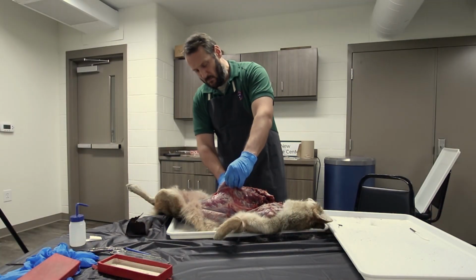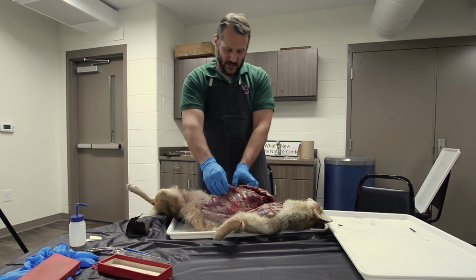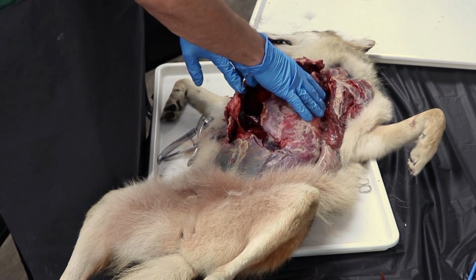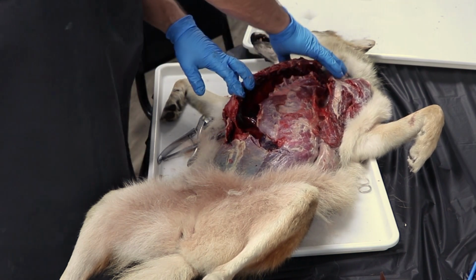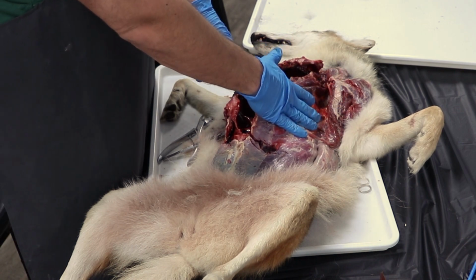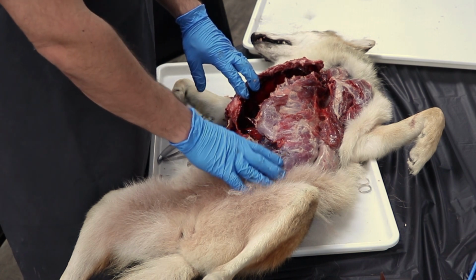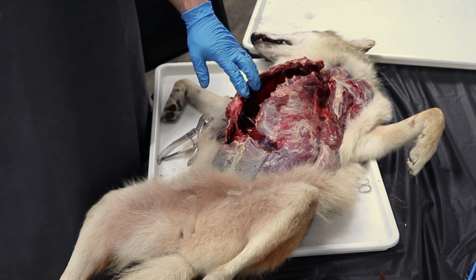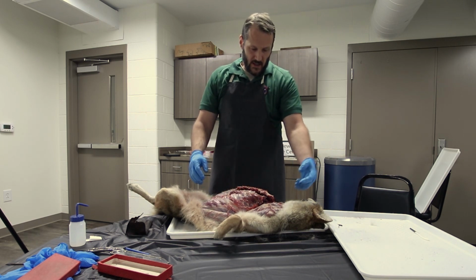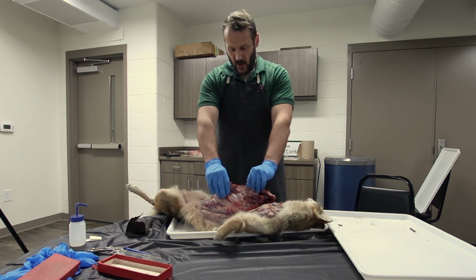Okay, before I obliterate it any further, one thing I would like to show is this separation between, so this is the thoracic region, so neck is the cervical region, what contains the heart and the lungs is the thoracic region, and then primarily digestive organs are going to be found in the abdominal region. Okay, so your trachea descends from the cervical into the thoracic region.